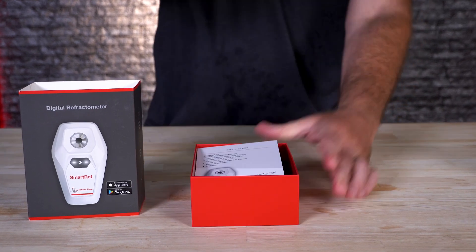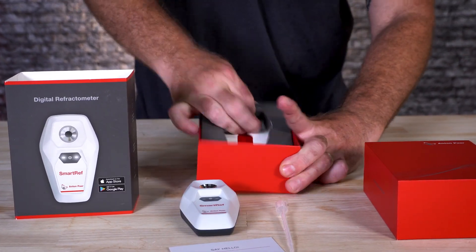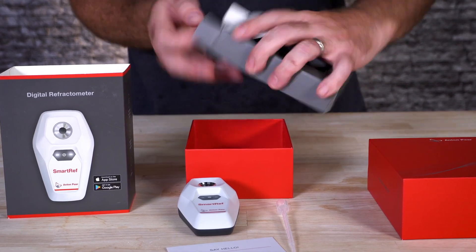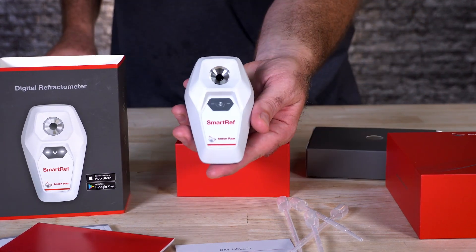The Smart Ref makes it a lot easier as you don't need a light source and you're not struggling to see through that. It allows you to get a big reading right on your screen and actually track and document it through their smart app. Just like a normal refractometer, it just takes a small sample size, but the software and the way that it's viewing is even more accurate than a normal refractometer.